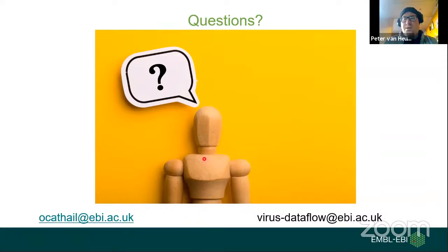Thank you so much, Colman. While I wait for people to put questions in the Q&A section, I've got a question of my own. So you're saying you're running Pangolin, but of late, especially with some of the sublineages of Delta, Pangolin has been kind of flip-flopping around a little bit with the different data releases as they refine their models. So when you say you run Pangolin, are you going to rerun it periodically?